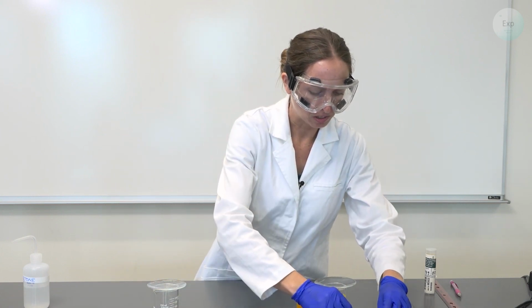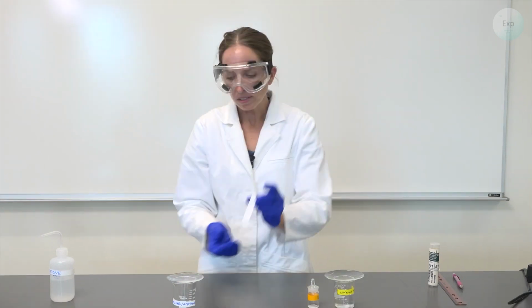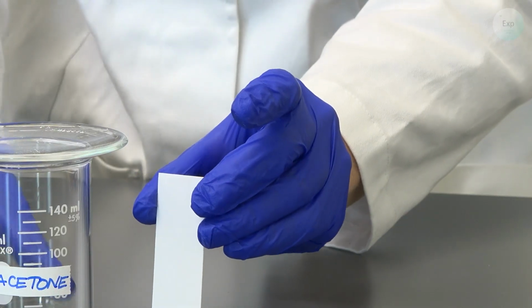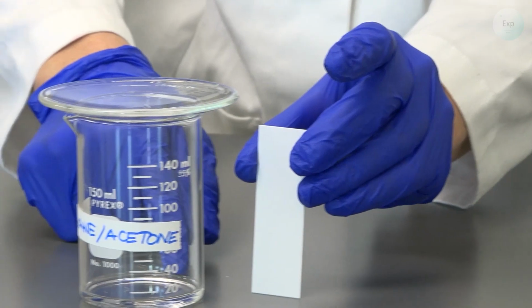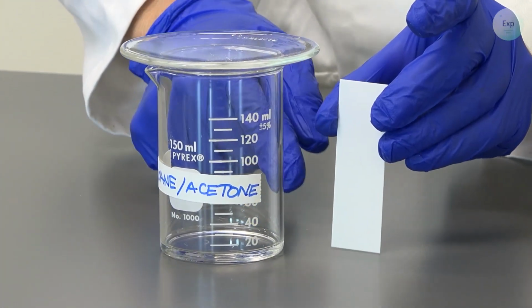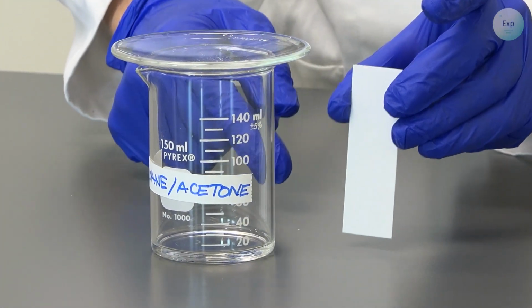Now to prepare our TLC plate with the sample. Once the TLC plate goes in, you want to be sure that the height of where you add the sample spots is not below the level of liquid that's there, meaning you want the sample spots to be above where the liquid level is.